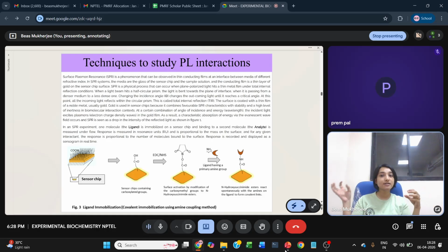That means that when electricity flows, all these free electrons are moving and carrying electricity. These electrons are called plasmons. So let us look at what happens exactly and why exactly we need gold.